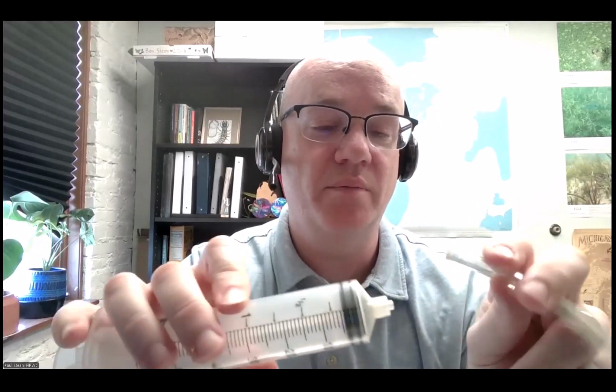All right, I'll move that to the side and just show you a couple other of our trickier pieces of equipment here. This syringe will be needed later on for our filtering process. The tip of the syringe has threads. However, the things that we're asking you to put on the syringe do not have threads. So here's a piece of Tygon tubing that you will be using for the process, and this does not have any threads in it. So until you get used to it, it might be a little tricky.